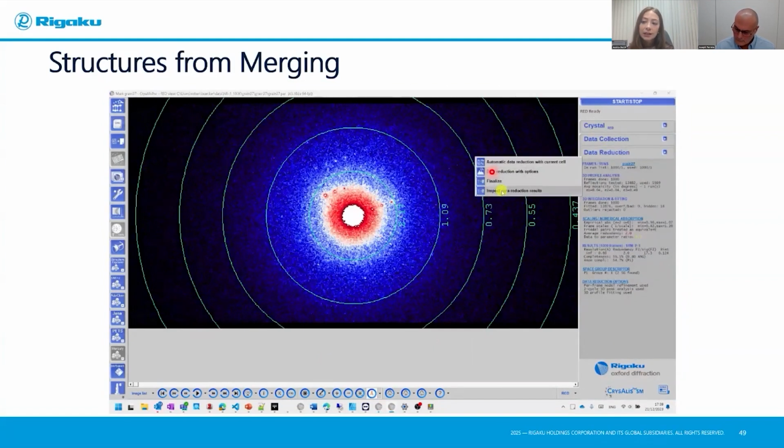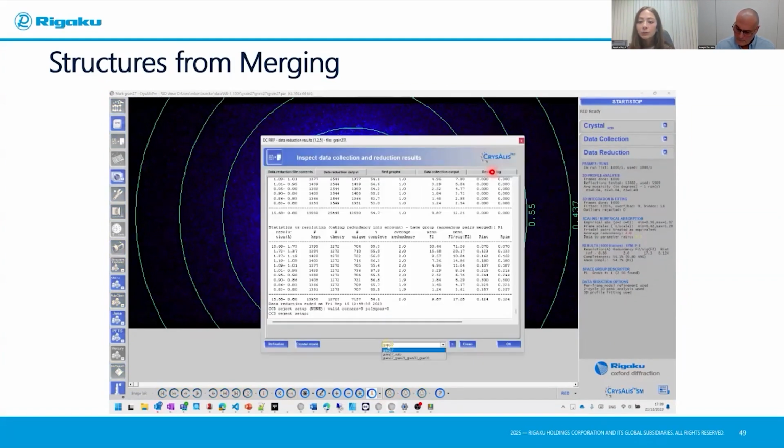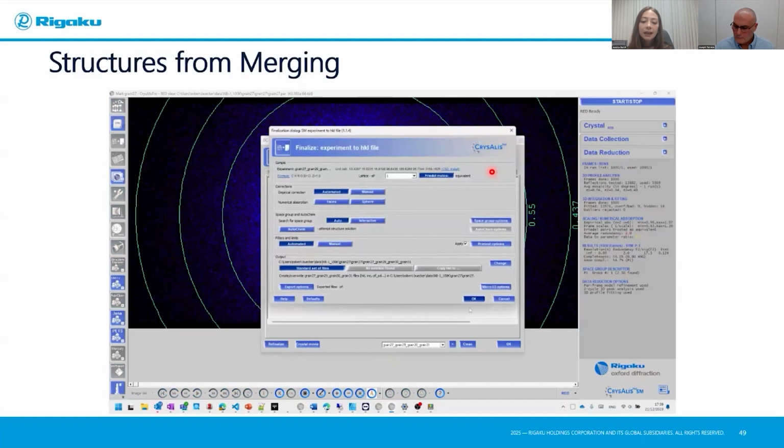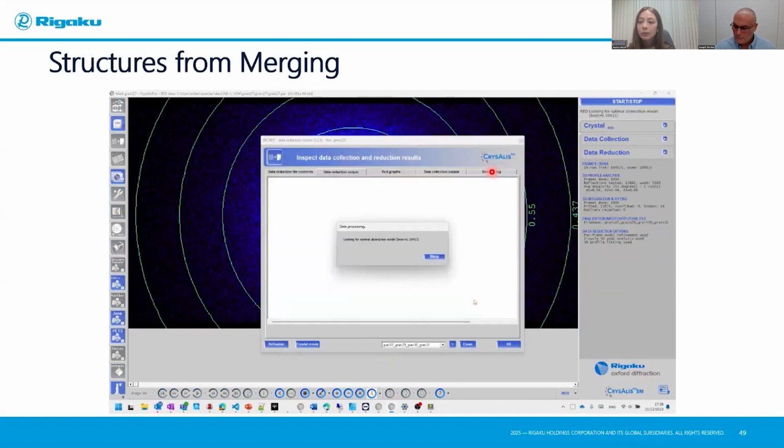And what we'll see here is that we combined 4 different data sets together, and we are doing this scaling, and at the end we can take something even as low symmetry as P1 and get really high completeness data from merging those data sets together. So that comes back to that point of we don't want all of our crystals to be laying on the same orientation, because we're going to combine some of those data sets to get a fully complete solution in the end.